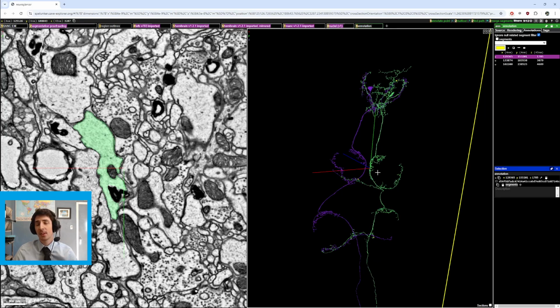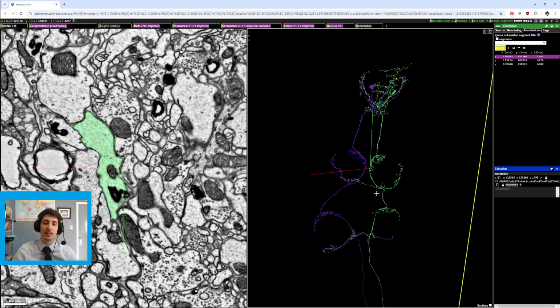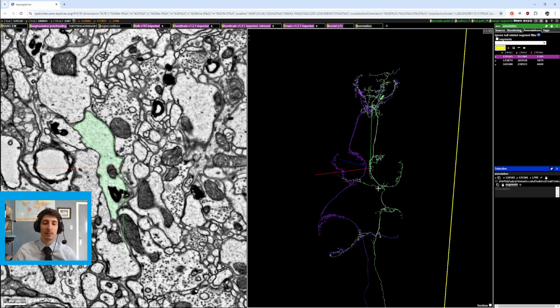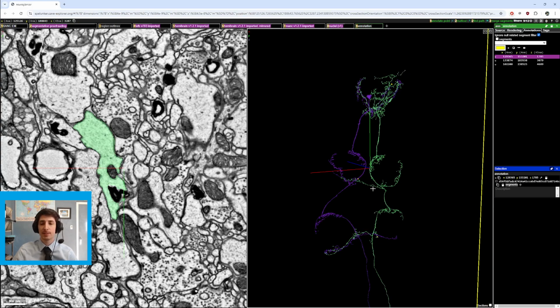So in this video, we're going to be talking about using similar cells to help you focus your attention on the areas that are different, and by doing so, reveal the missing branches in those locations, and then add those branches to the appropriate cell. And just in general, a guide to help you when you have a tough cell that you cannot find connections to. This is one of the ways that can assist you in finding those tough connections. So let's get into it.